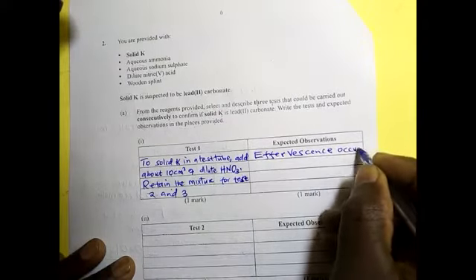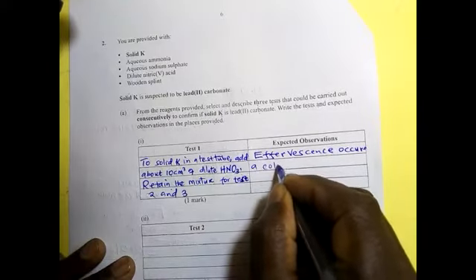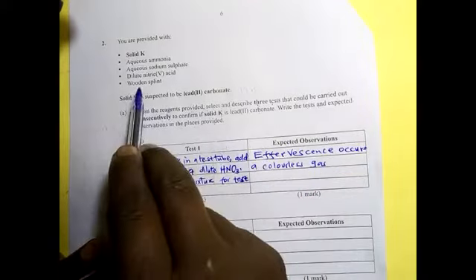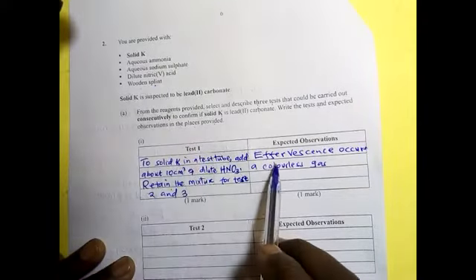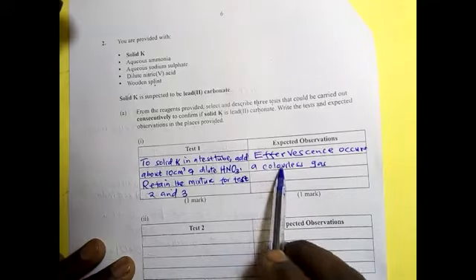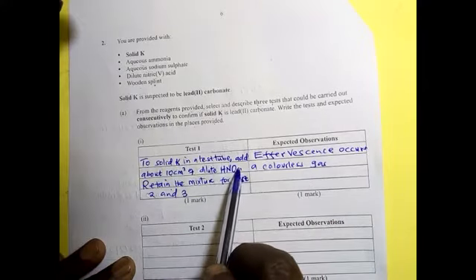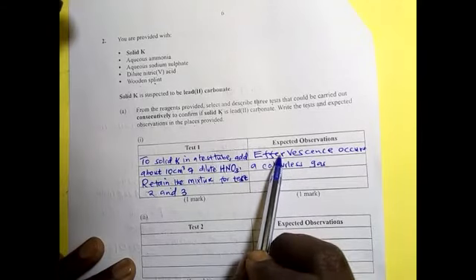Effervescence occurs. Another observation is that a colorless gas is produced. Because you are given a wooden splint, now you will use that wooden splint. Will this gas extinguish the splint, or relight it, or what will happen? For a colorless gas, we expect carbon dioxide to be produced. It is the carbon dioxide which causes the effervescence. Carbon dioxide does not support combustion.